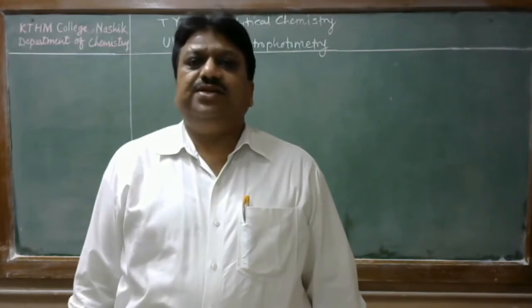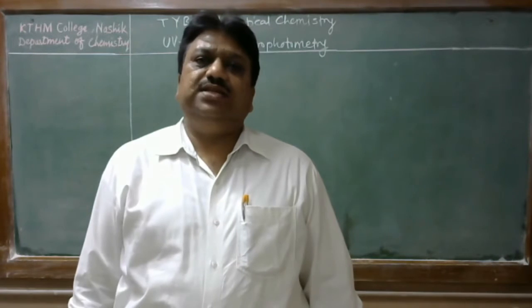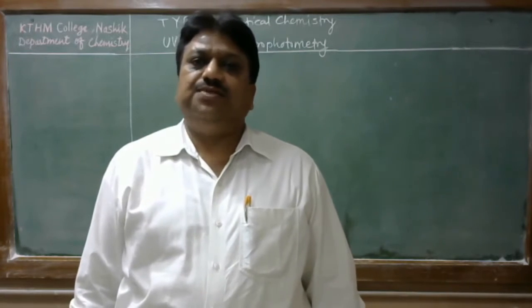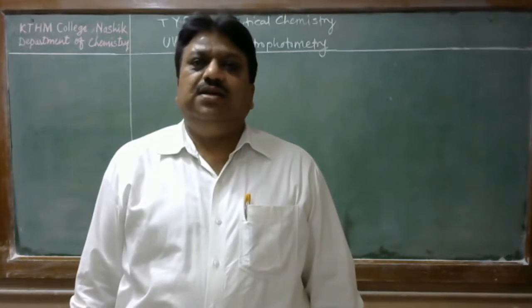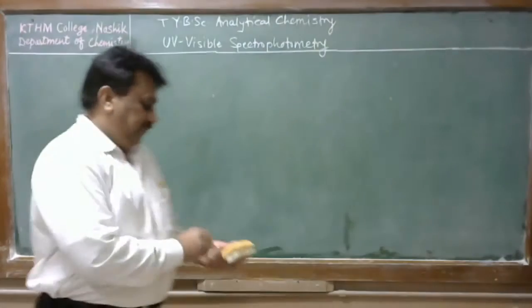Student, in previous lecture we discussed the optical components of the spectroscopy. We also discussed the arrangement of these optical components for absorption spectroscopy as well as for emission spectroscopy. In today's lecture, we discuss the monochromatic system, that is a wavelength selector for absorption spectroscopy.